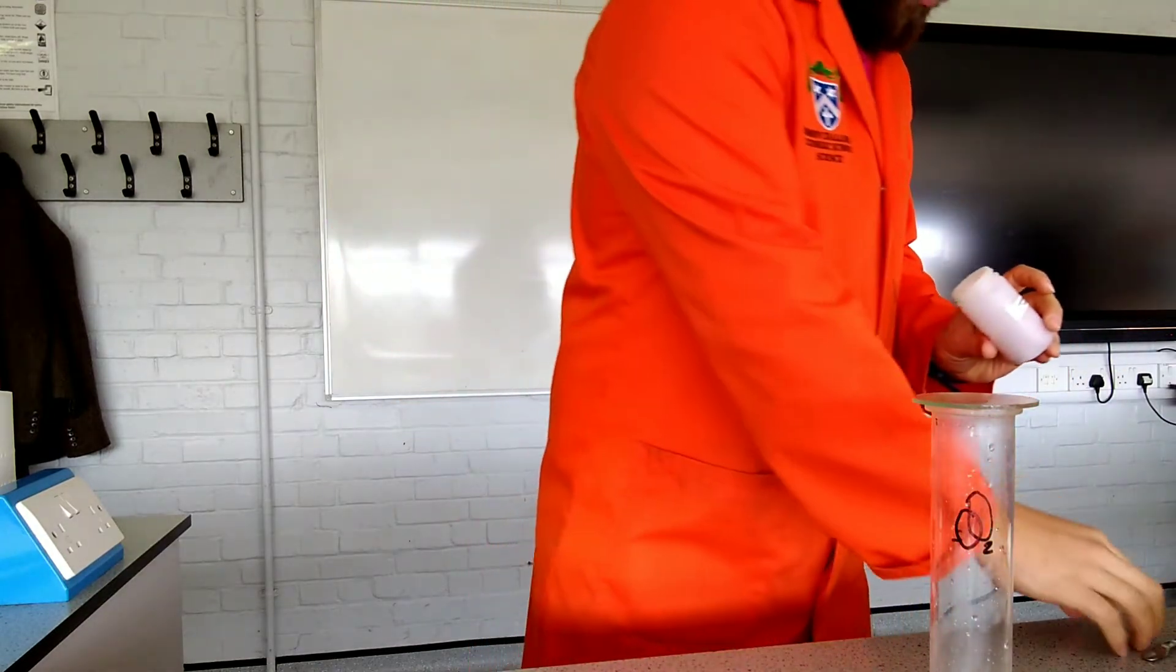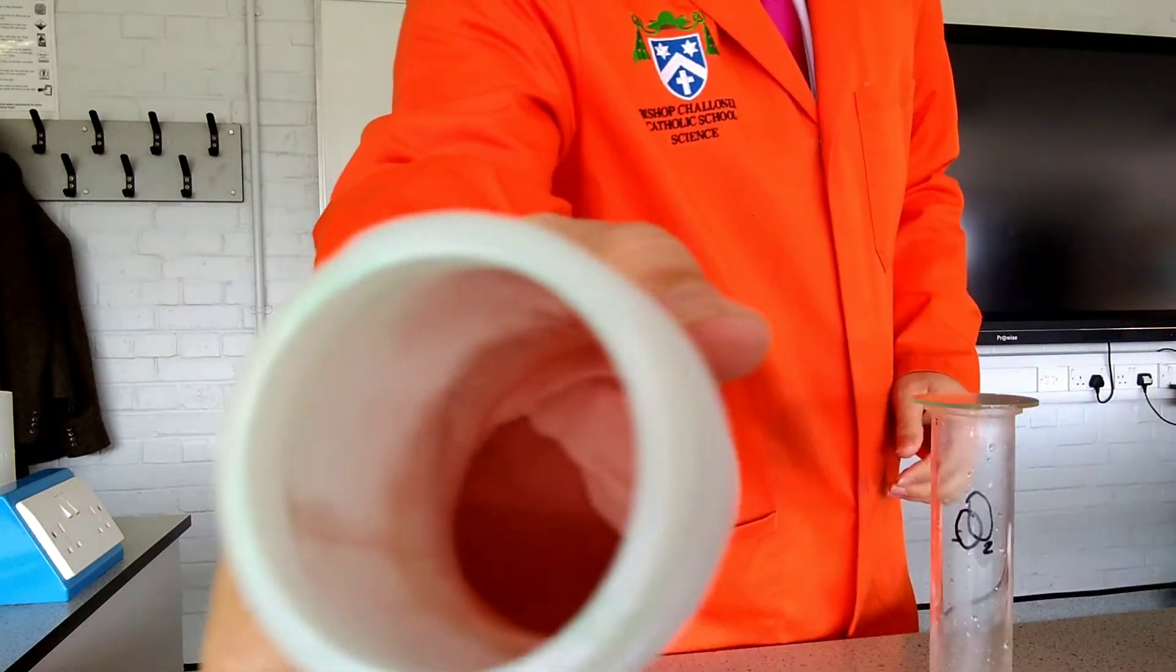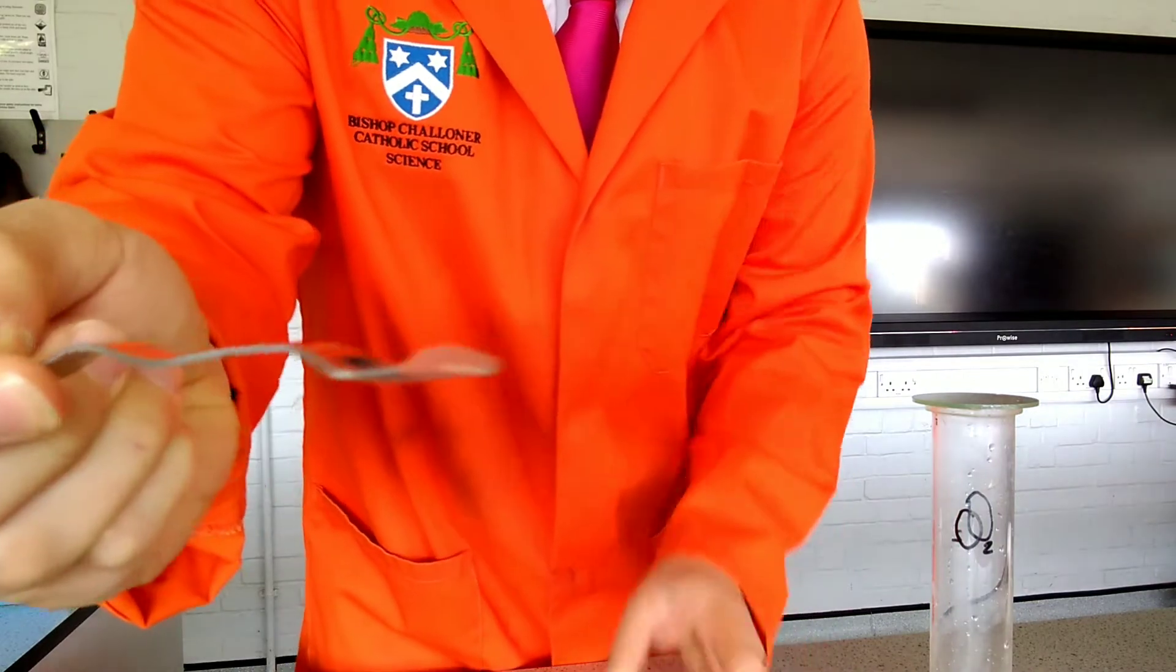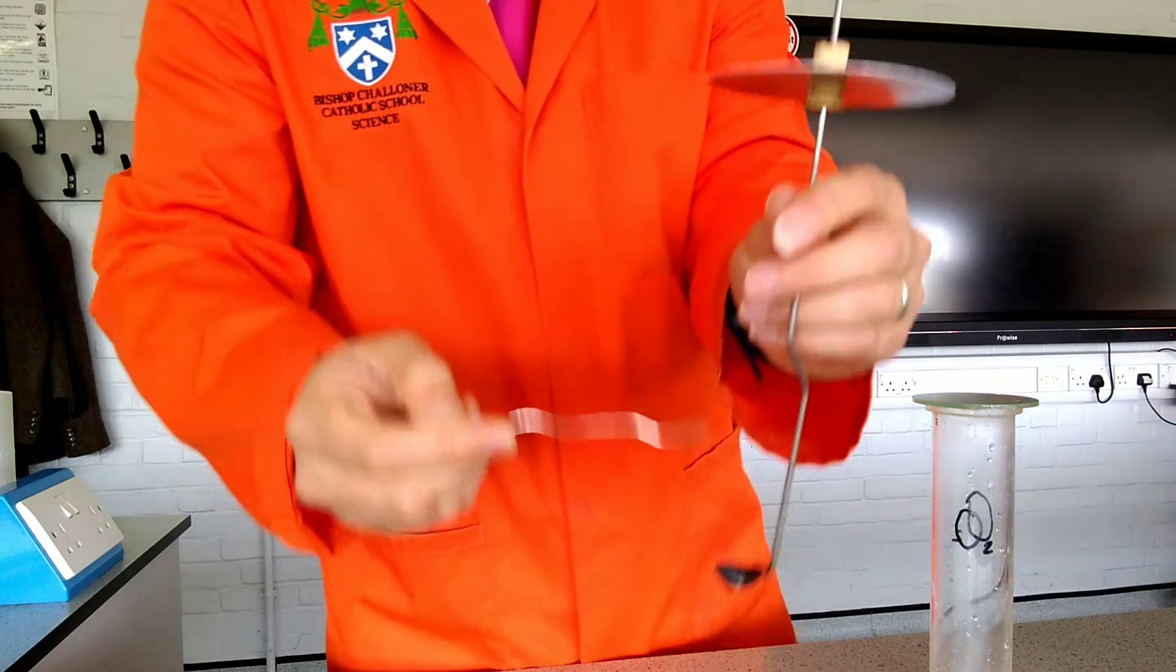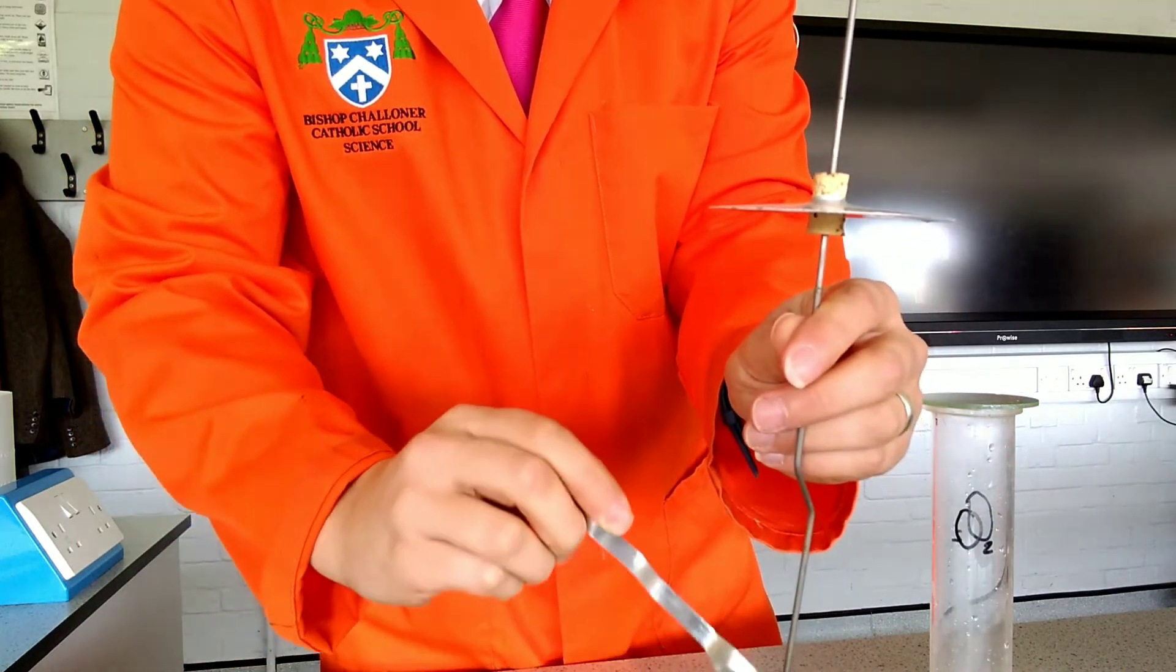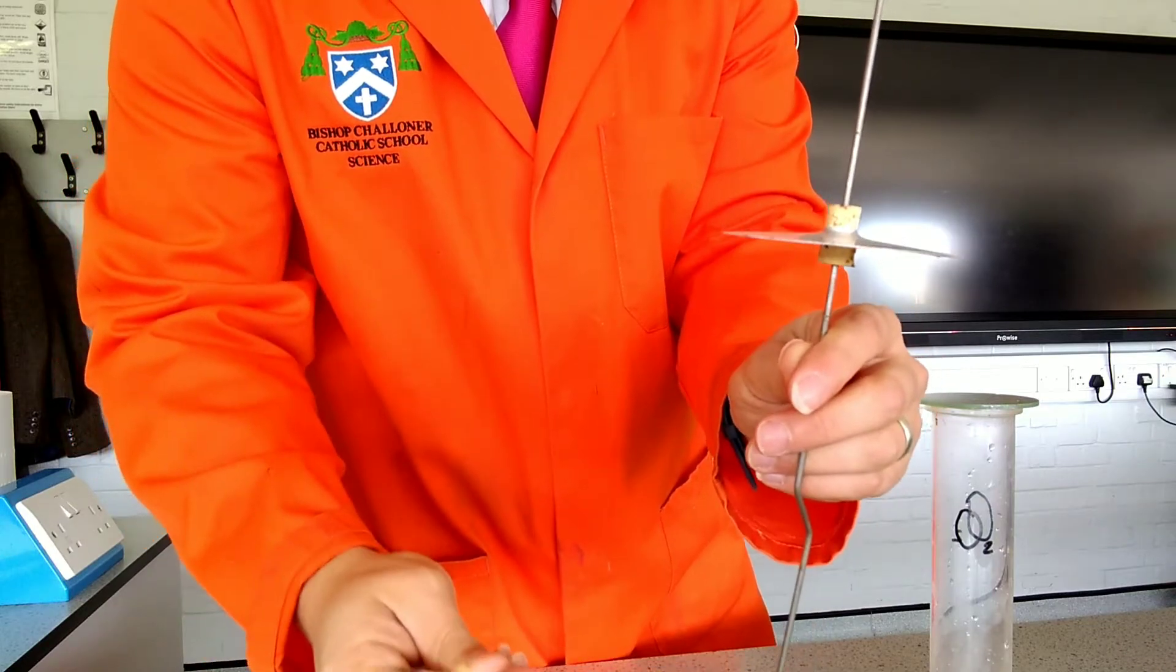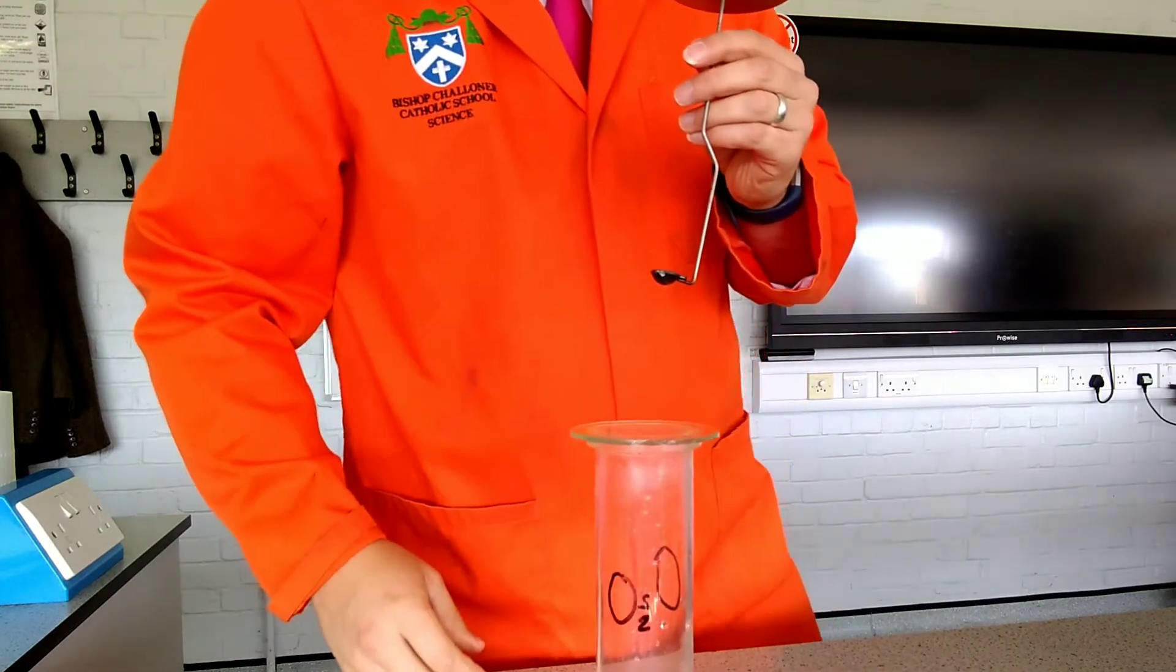So the first thing we're going to look at is some copper. Now copper is a sort of orangey color. I'll show you that on the spatula. It's a sort of browny orange. And we're going to use a kind of fancy spoon thing here called a deflagrating spoon. Now I've got a jar here of oxygen gas.